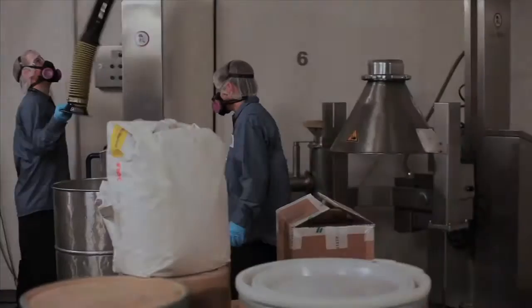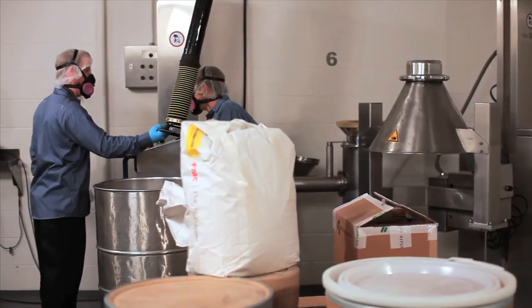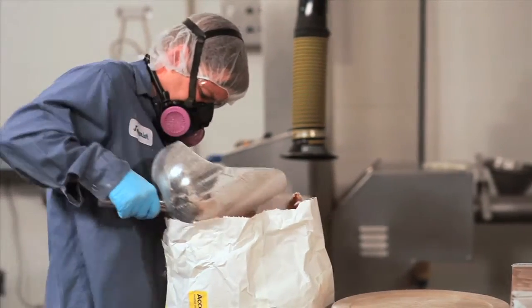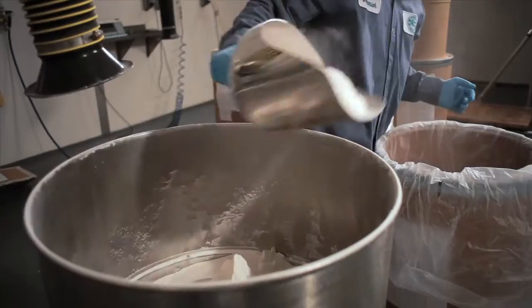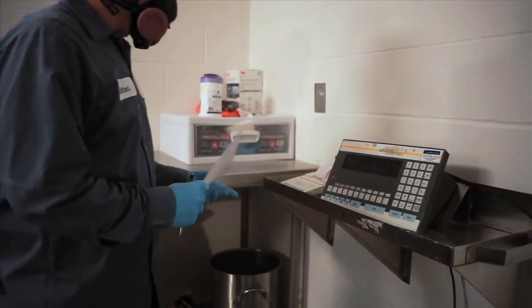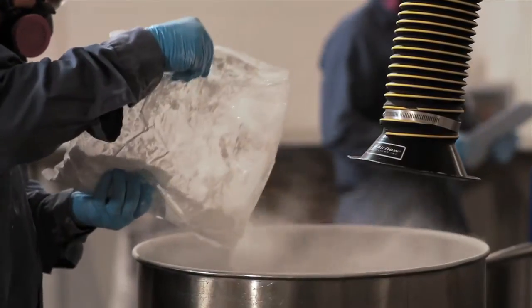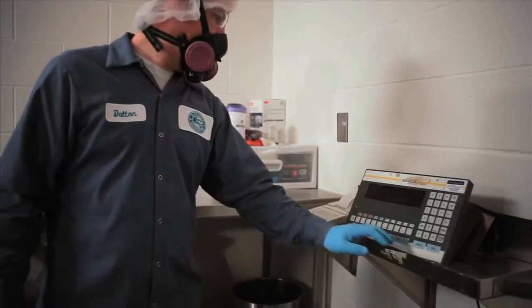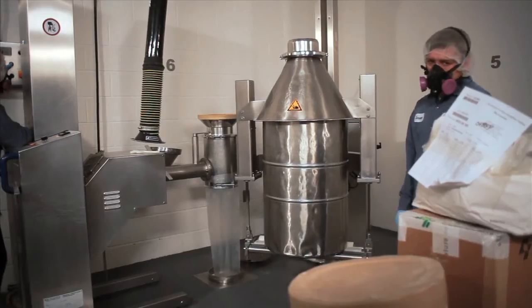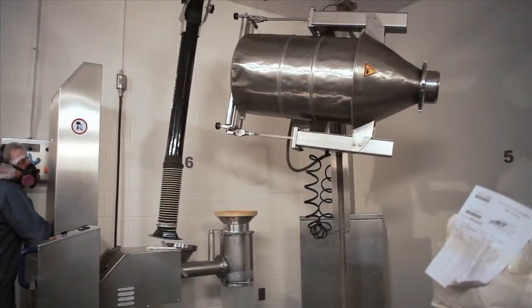Now that we've seen how Synergy products are formulated and tested, let's take a look at how they are made. The issuing room is where it begins—a measuring room where the strict recipe developed in our pilot lab is followed and produced on a large scale. Every formula is carefully measured and weighed to the milligram. Once a batch is done, it's sent downstairs to be mixed.